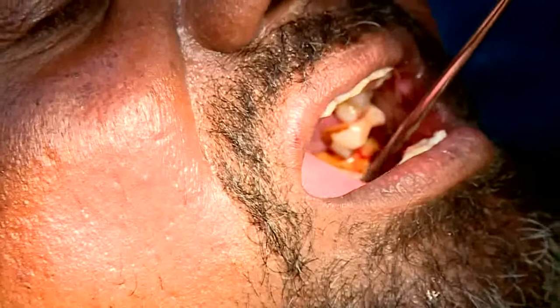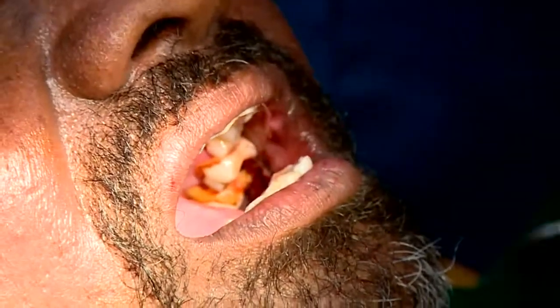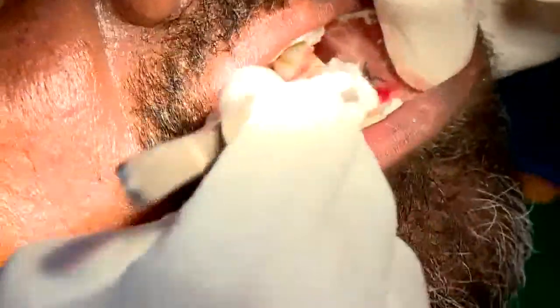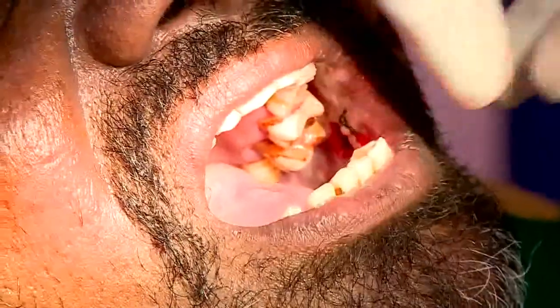For huge specimens, sometimes the lower part tends to rest on the container. You can actually suspend the specimen in the container, because the lower part is not going to be fixed if it touches the container. So you can suspend the specimen in a container if it's a huge sample.